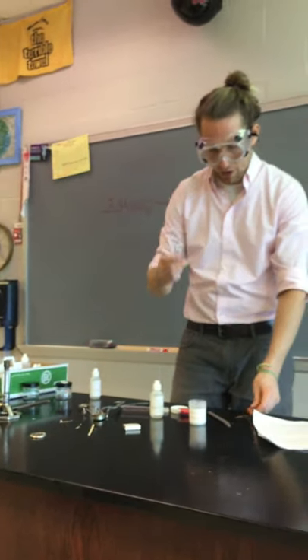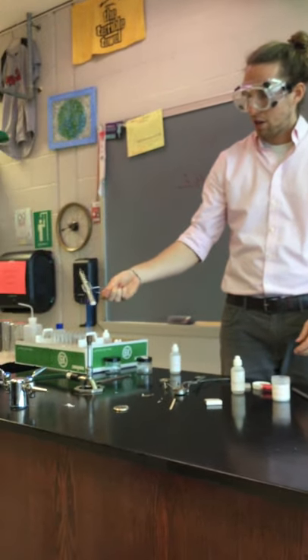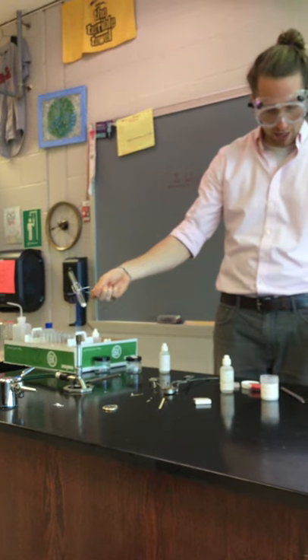And then we'll see what happens whenever we put that litmus paper into the mouth of the test tube. All right. We also have a fun little test tube clamp. And we are going to heat this over the flame for about 30 seconds. And I'm going to point it away from me while that is taking place.